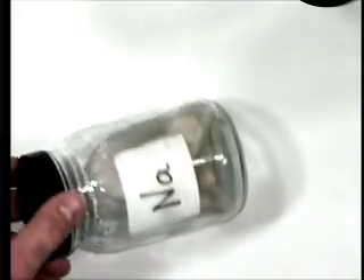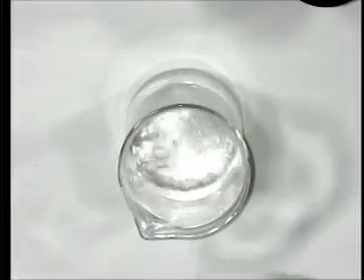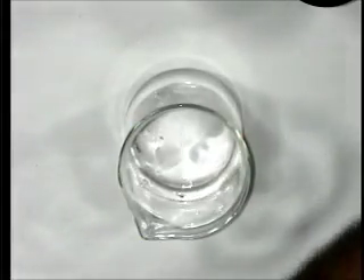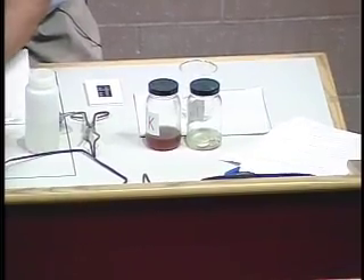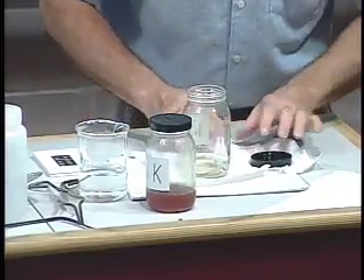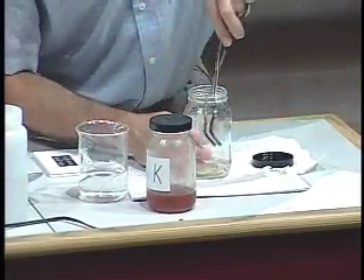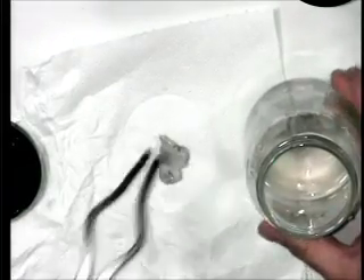Now you can see in the bottom of this — I don't know if you can see it or not — but there's sort of an oily liquid. Over on this side there is a blob of sodium metal. So what I'm going to do is take a beaker of water. I made the statement that if you react these metals with water, you get an alkaline solution. The oil is just to keep the air and water away from it, for reasons that will become apparent in a moment.